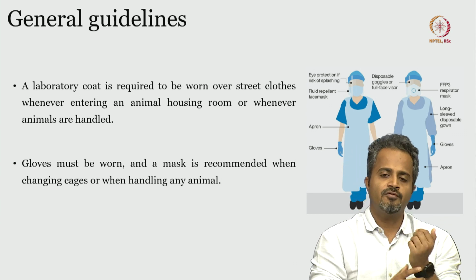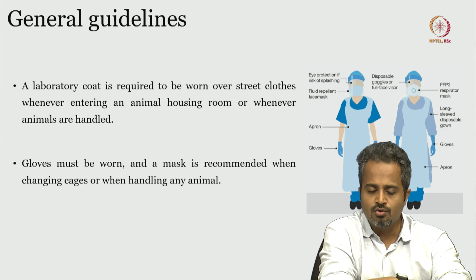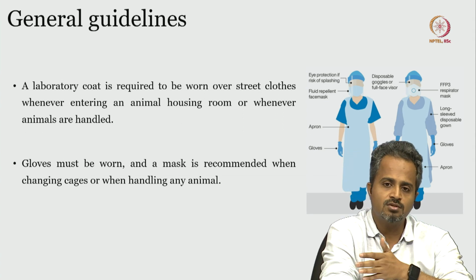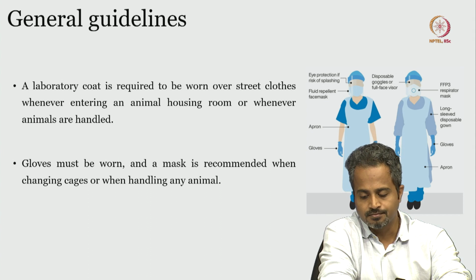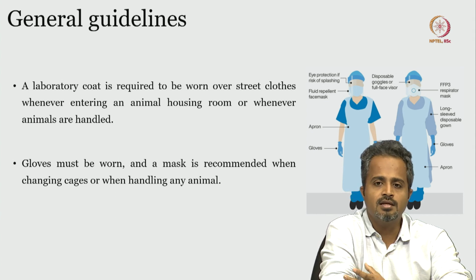So there are two different ways of looking at it. Are you going to wear a sterile apron, or are you going to wear just a lab coat, which is going to be a barrier between you and the animal, as I said earlier. So that depends on what sort of situation you're really handling the animal in.